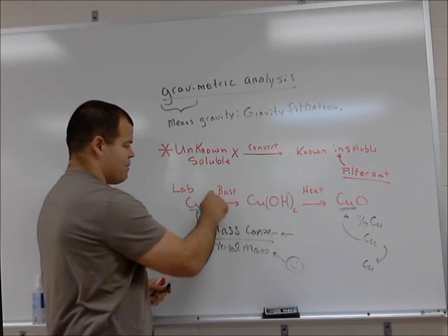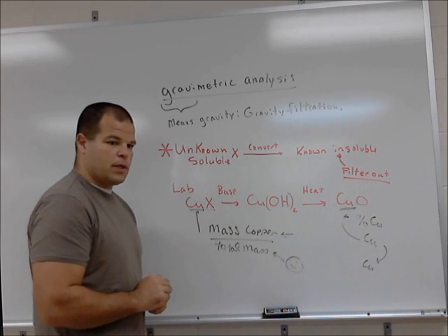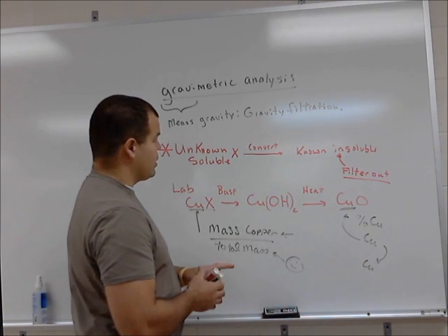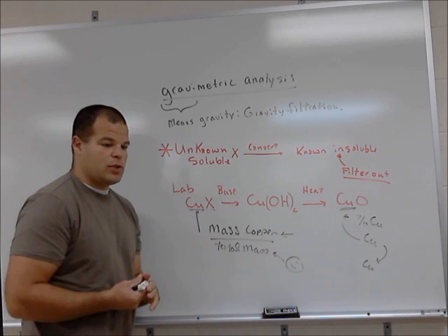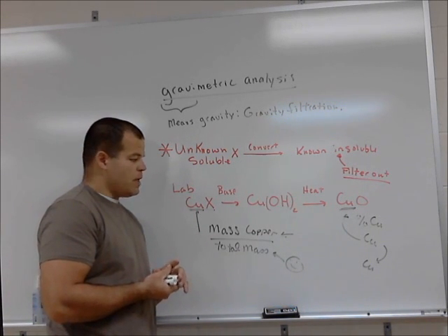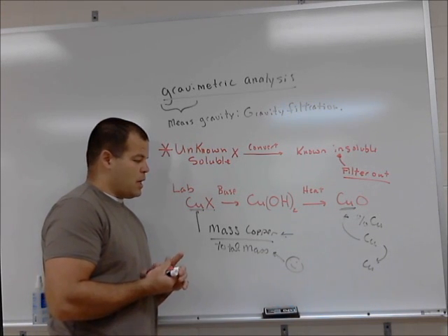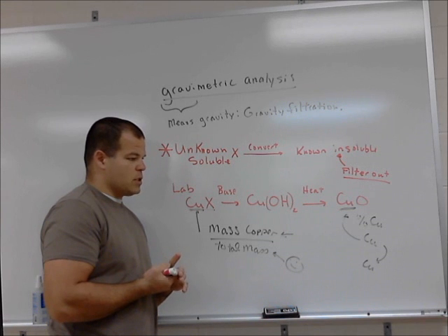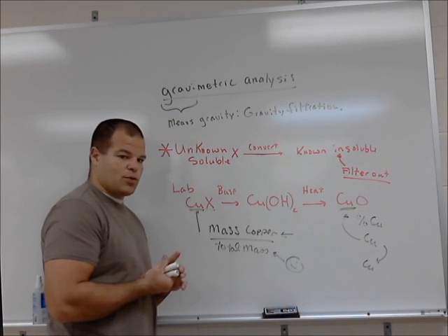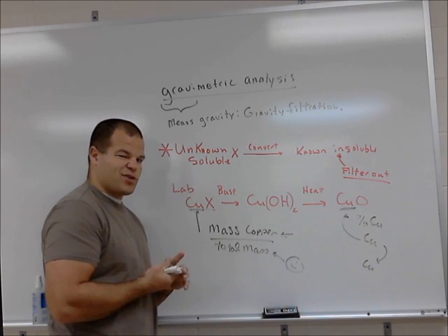So make sure if you add base, add plenty of base. Okay, when you're heating, don't lose any copper. For this lab, we will not be doing gravity filtration. We'll be doing what's called a suction filtration. And for that, you're going to want to learn how to use a Buchner funnel, and you're going to want to watch the video on a Buchner funnel. I will not be explaining that in class, but this is called gravity or gravimetric filtration.